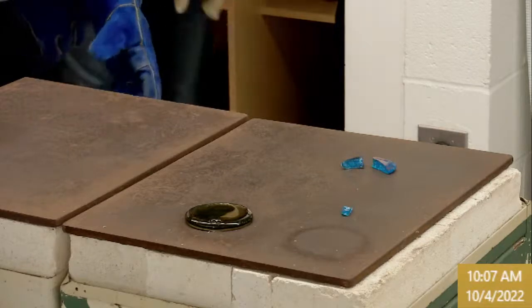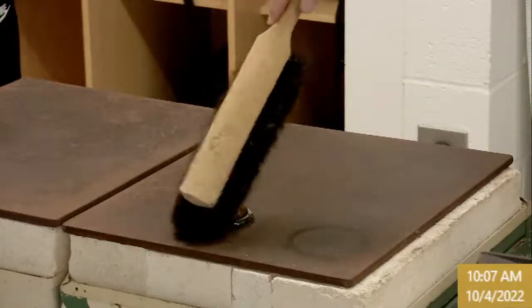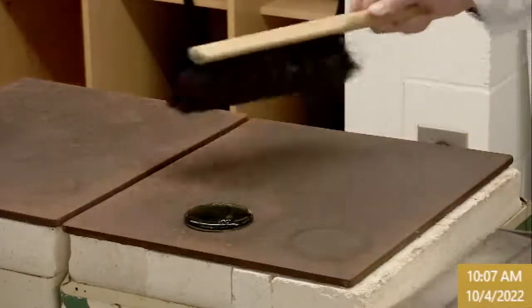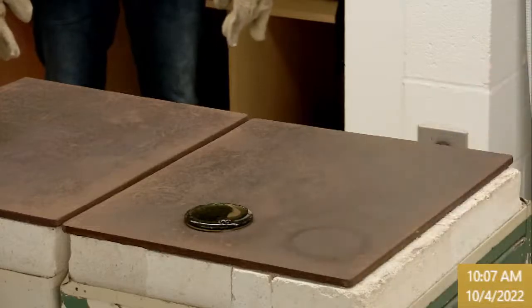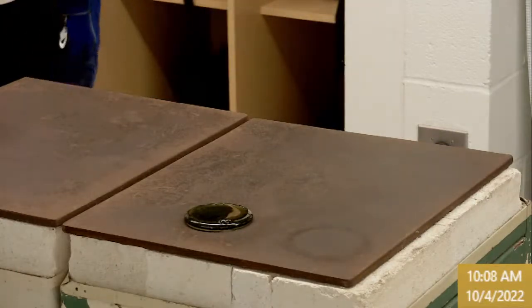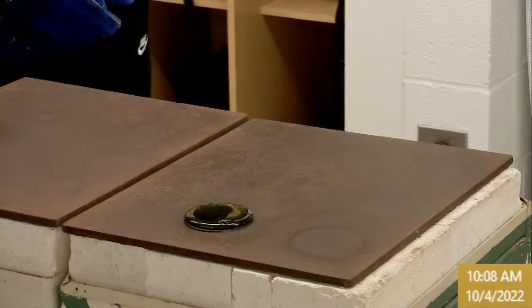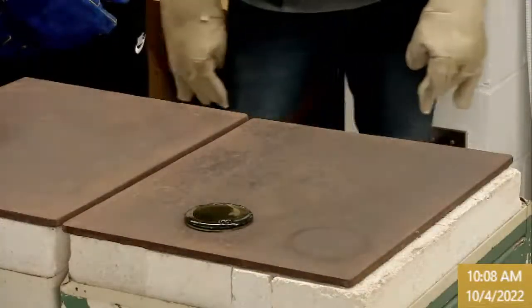Yeah, I'll put this in a beaker. The biggest thing is, make sure there's no shards on you and you're not going to get cut. I don't think we have any complications there, but you also have to get this completely clean from those shards, otherwise they end up in other people's samples. So I think that's everybody's. So let me put this in a beaker quick. Glass plus a little bit of floor dirt there. Yeah, it is a nice pretty blue color. So we will eventually label that one to be A2.